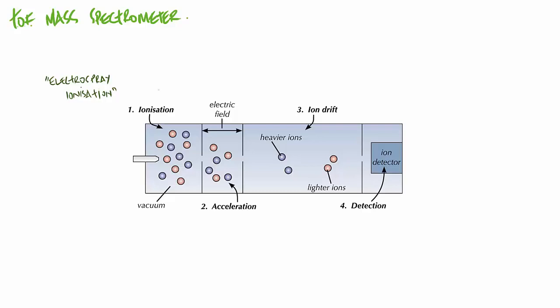And that's the key thing: we're trying to create charged particles from what were uncharged initially, so we're trying to turn them into ions. So this one ultimately adds protons to them. I don't like it, and I wouldn't use that if I were you, but you can obviously if you wish. The way I would go about this is the old school way, which is the use of an electron gun, something that bombards the sample with high energy electrons.